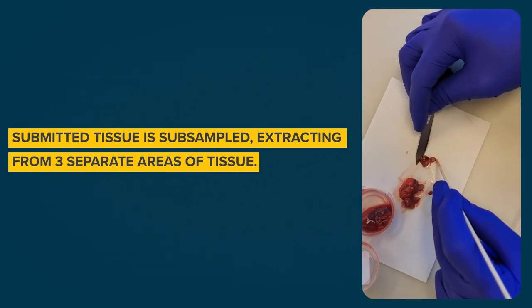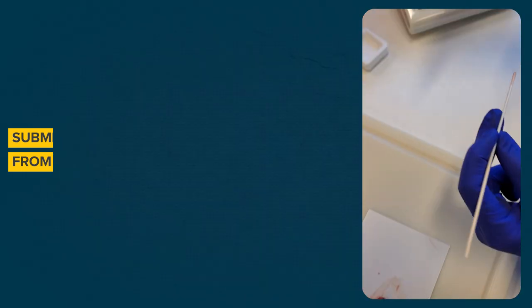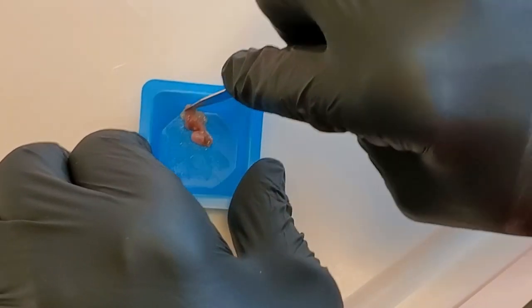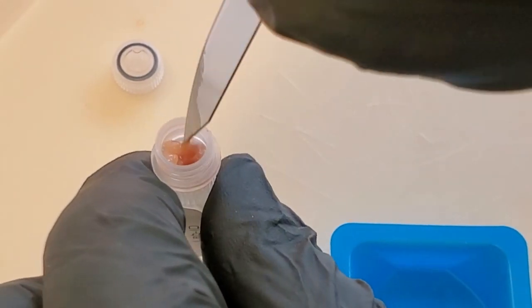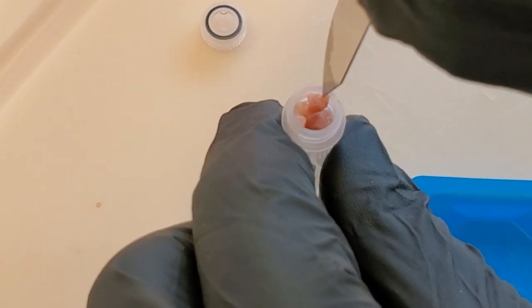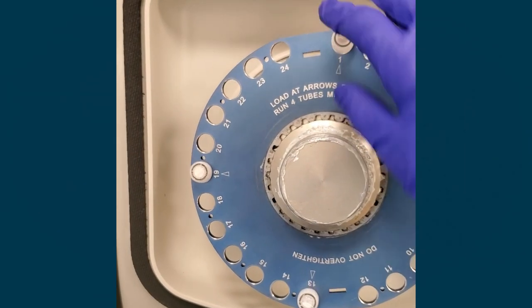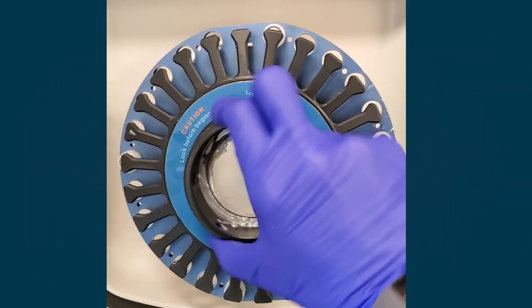We subsample the tissue, extracting from three separate areas of the submitted tissue. Next, we weigh the sample, chop it up, and put it in a grinding tube. The sample in the grinding tube is homogenized to make a lymph node smoothie.